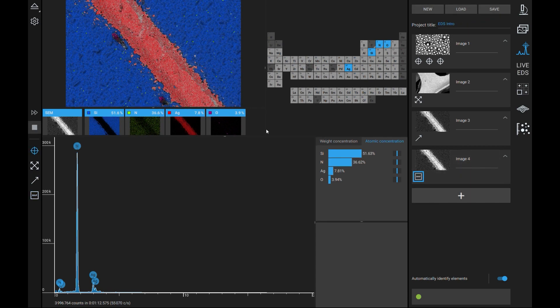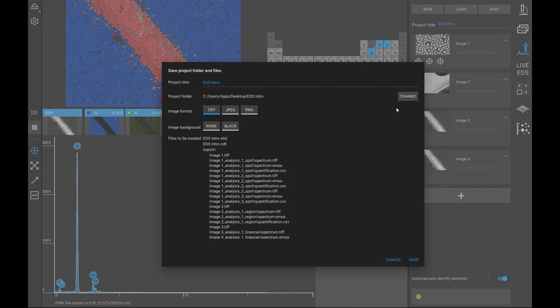Once all the analyses have been completed the user can save their EDS project. Saving their project will generate a folder filled with all the data acquired in the project along with an automatically generated report. This report will show each measurement, its quantification table, and its spectra.